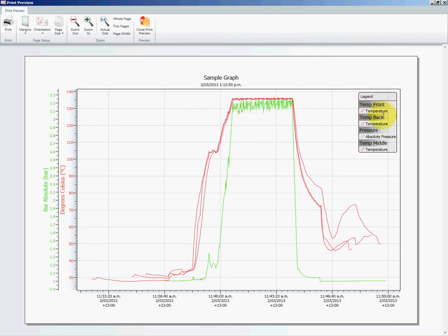I've got all of my loggers with an internal ID that I've labeled, and this is where temp front, temp back, pressure, and temp middle is coming from. And so that's made it easier for us to bring the data in.